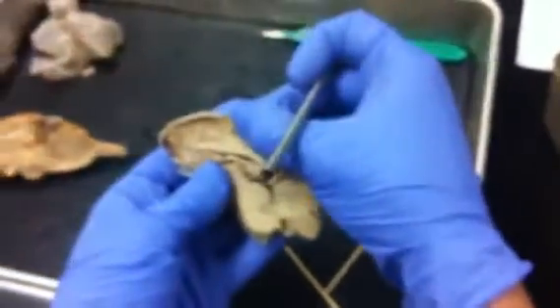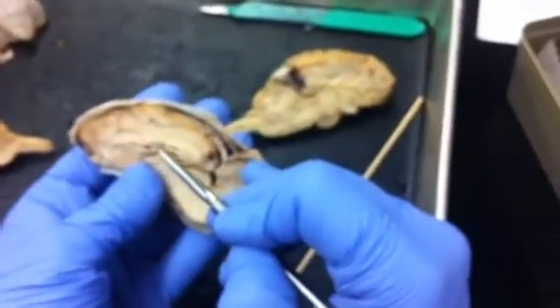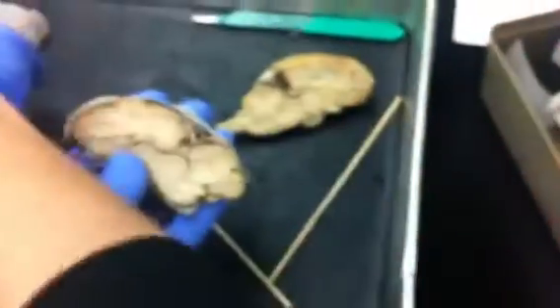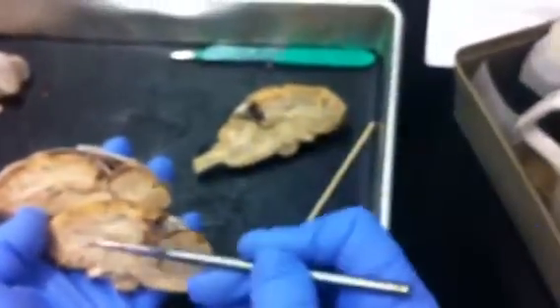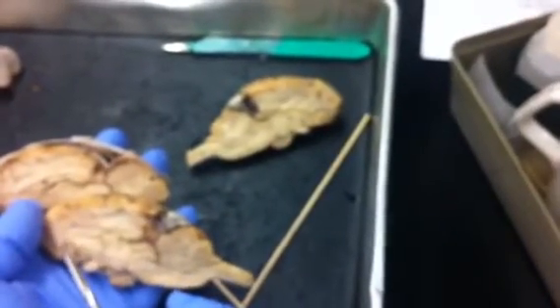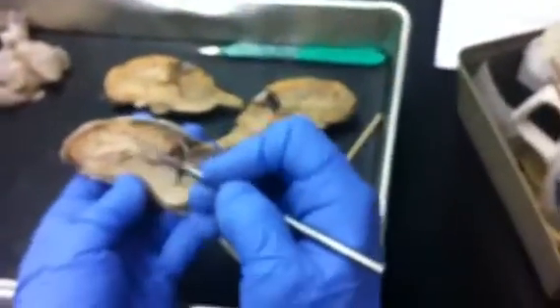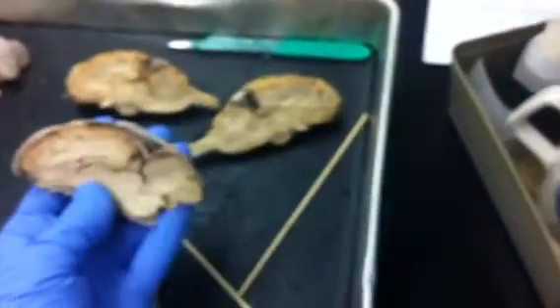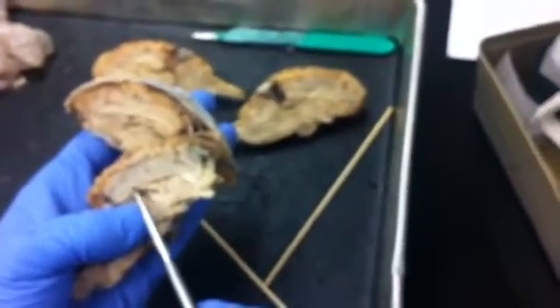So let me just show you on here. You can see a little bit better. So this band of white right here, that's your corpus callosum. It's sending information from one side to the other. I was trying to get it in here, but there's a little piece of tissue from this side over top of it, and it makes it hard to see, but it's right in there. Not the bottom part, but right there is the corpus callosum. And even this one's not great. On some of the brains, you can see it really, really well. Corpus callosum.